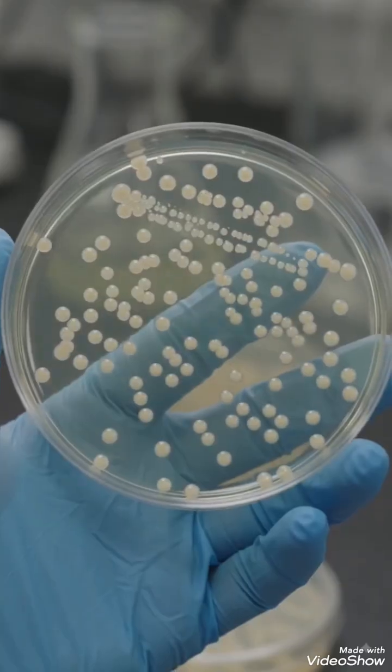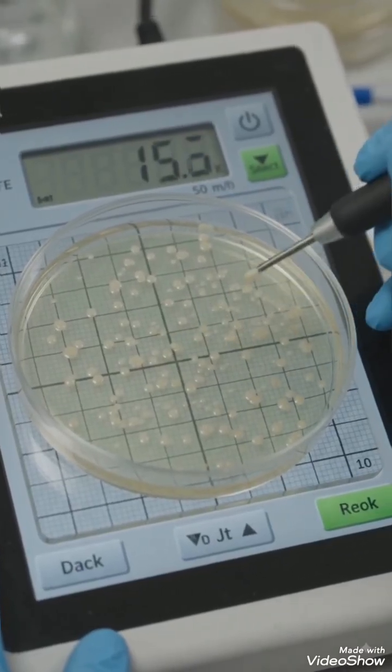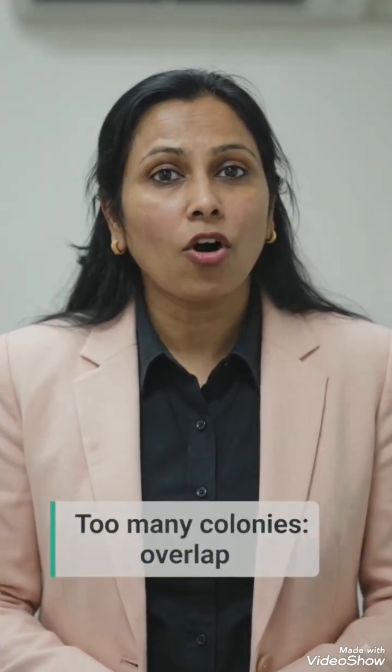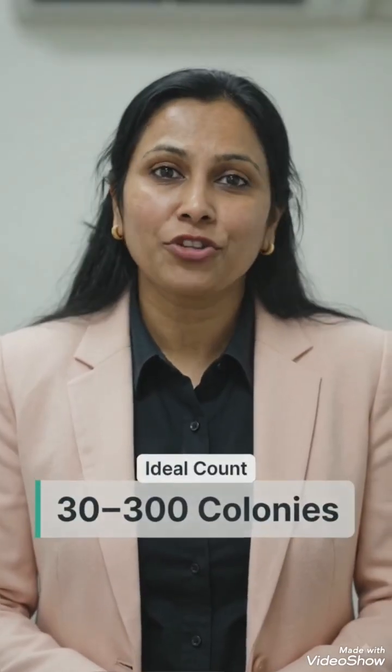After incubation, colonies become visible. Only plates containing between 30 and 300 colonies are considered suitable for counting. Too few colonies decrease accuracy. Too many colonies overlap and cannot be counted reliably. Let's calculate CFU.